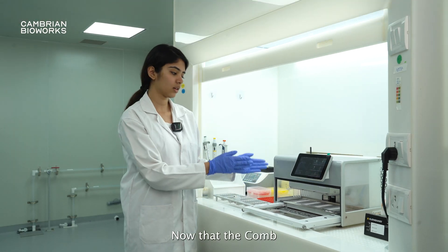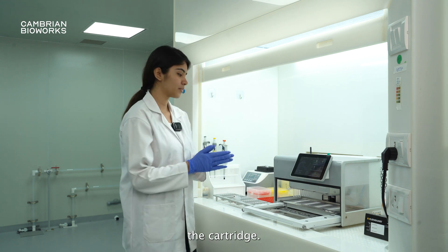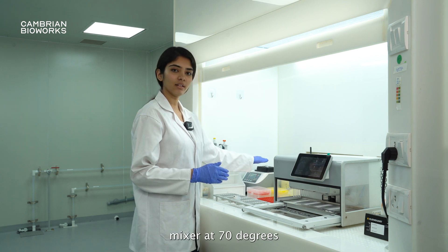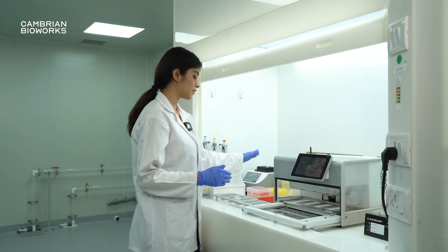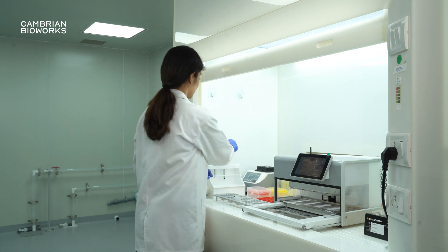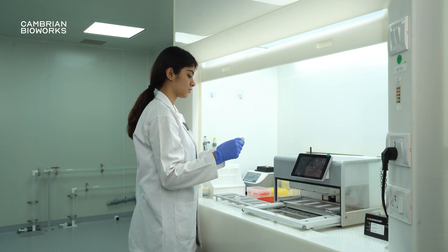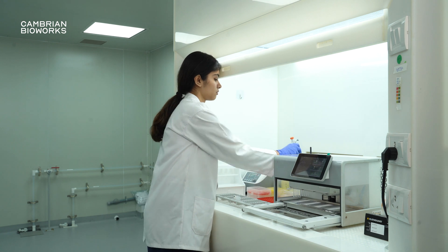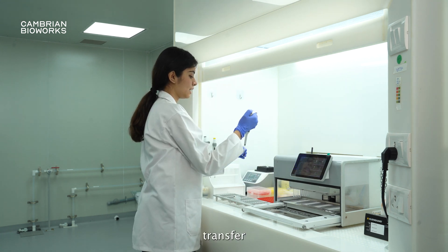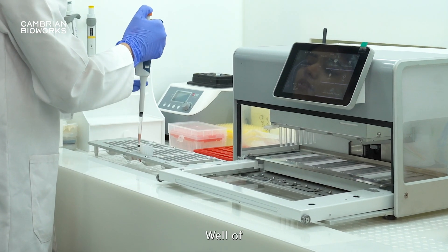Now that the comb is set up, we will add the sample into the cartridge. I had already placed my sample inside the thermomixer at 70 degrees, and I will be transferring 430 microliters into the first well of the cartridge.